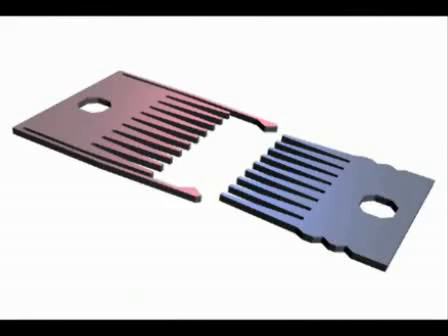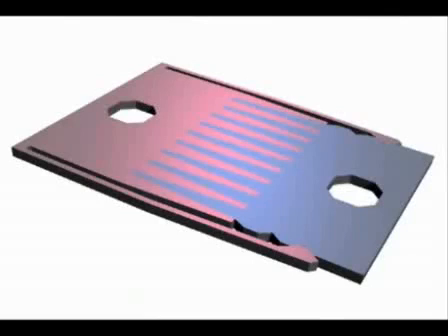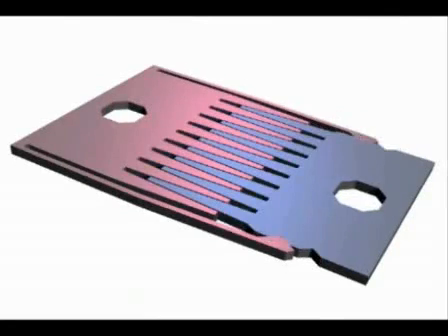Each device is divided into two parts, which snap together in two possible configurations. The first brings the two cell populations into contact with each other. The second separates the two populations slightly so that the cells cannot touch. Here, contact interactions are prevented, but interactions through secreted factors are preserved.